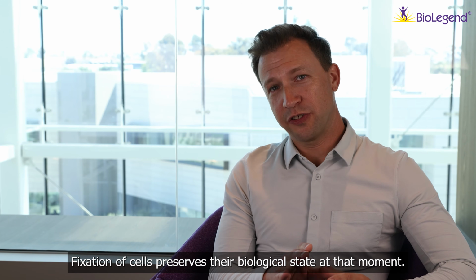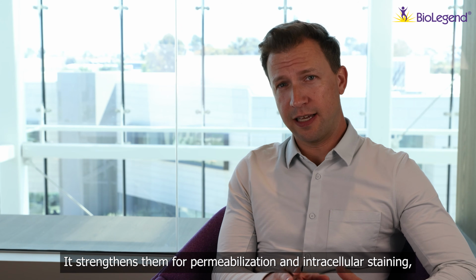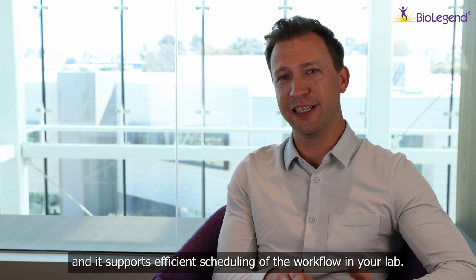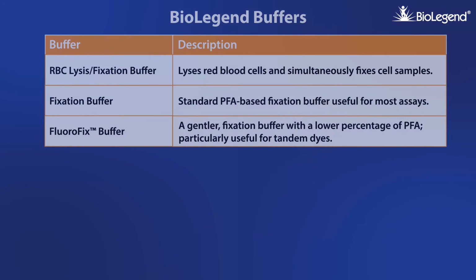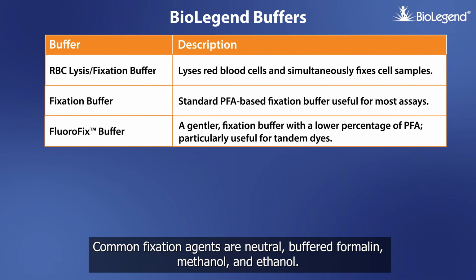Fixation of cells preserves their biologic state at that moment. It strengthens them for permeabilization and intracellular staining, and it supports efficient scheduling of the workflow in your lab. Common fixation agents are neutral buffered formalin, methanol, and ethanol.